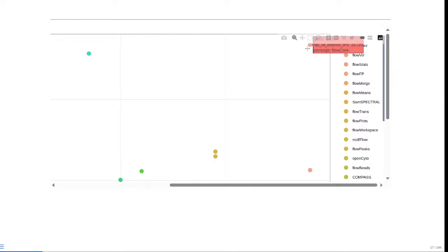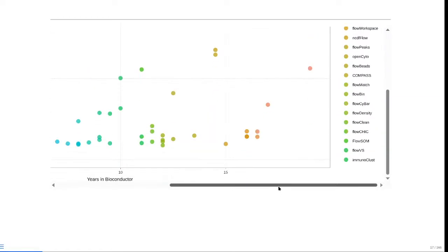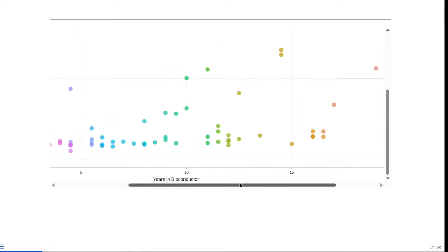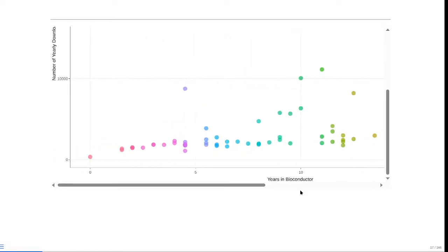And it has over 26,000 or so downloads every time Bioconductor refreshes and upgrades to a new version. So everything else as far as packages goes is very, very much lower in terms of total number of downloads, and it's much, much younger in age. So it's not like heading on 20, it's over on the other side.